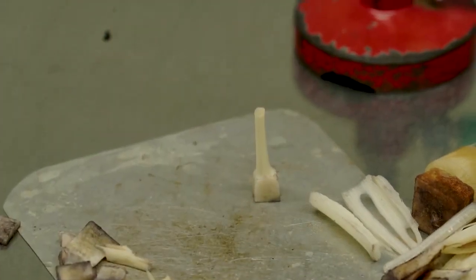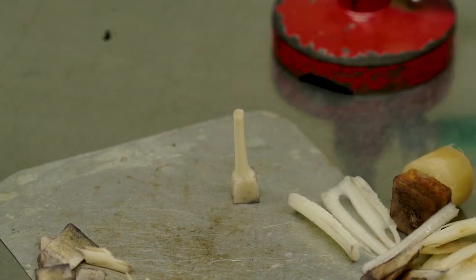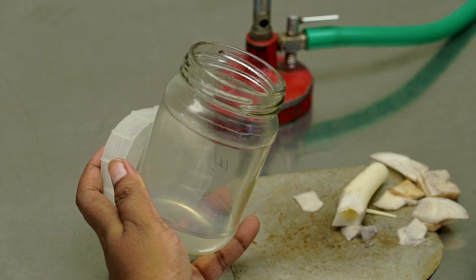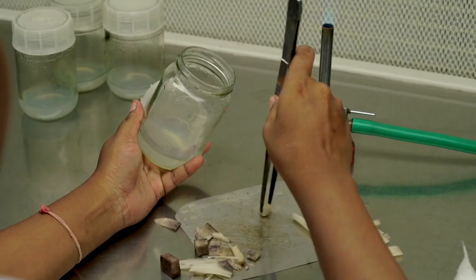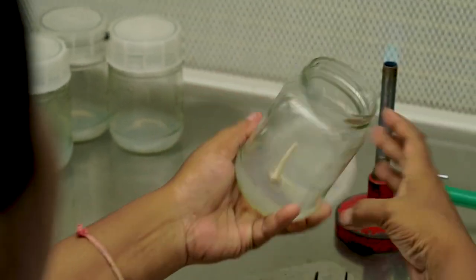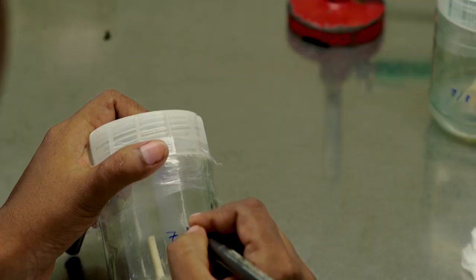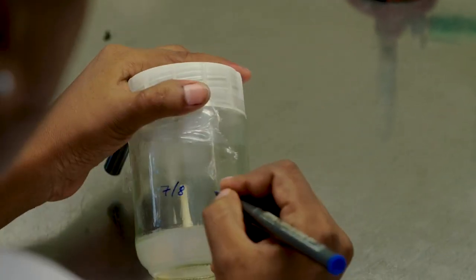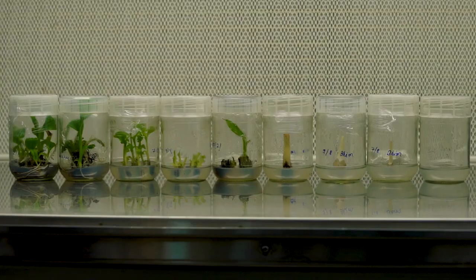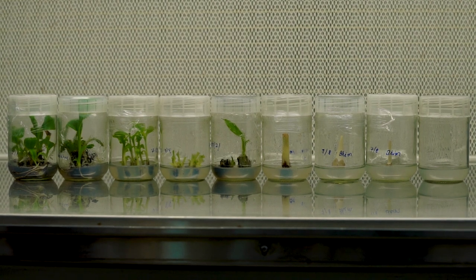Once we get the shoot tip, it will be inoculated into the glass jar. This nutrient media is known as initiation media or establishment media. As you can see, we have inoculated. Now immediately we have to close the lid of the jar. Then we write the date so that we can remember the exact date of inoculation, so that we can observe the number of days to proliferation.